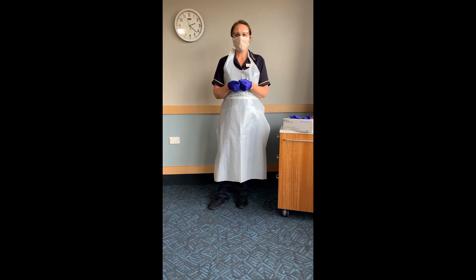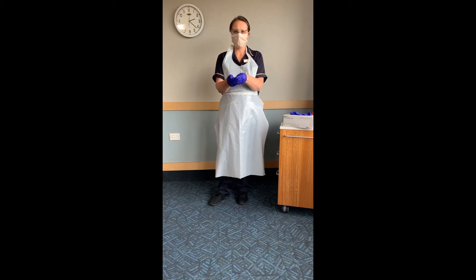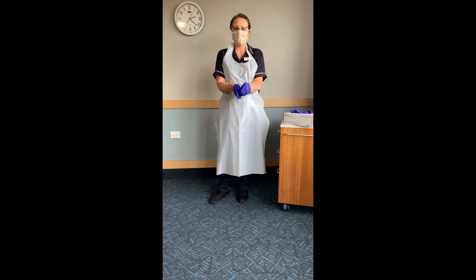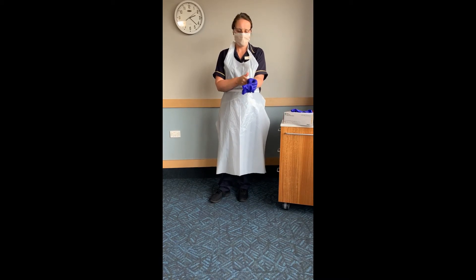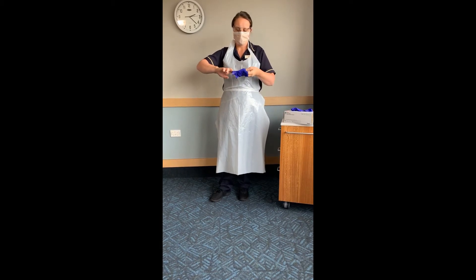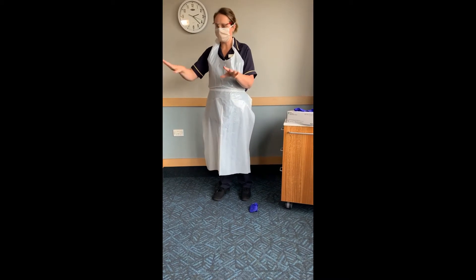Hayley will now demonstrate removal of PPE. Grasp the palm of one glove in your gloved hand, pull the glove off keeping hold of it. Place your finger on the inside of the other glove and pull that over the first glove and put it in the bin.